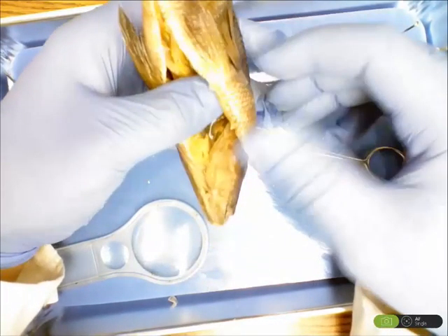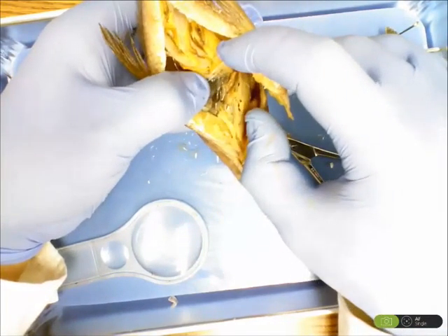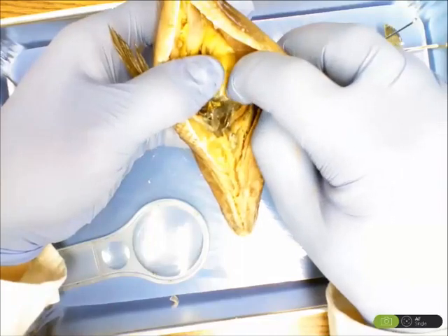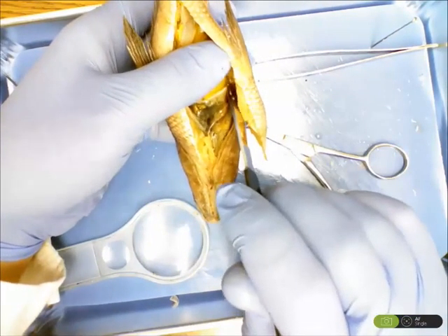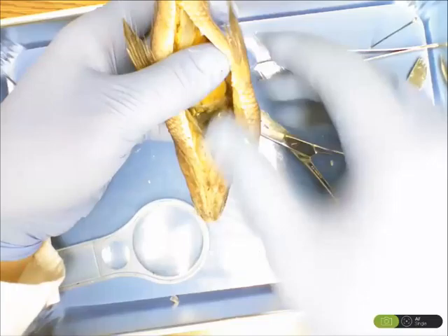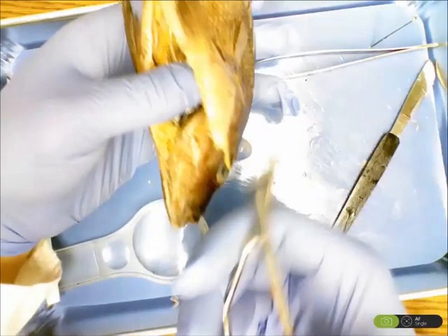Take the side that comes out easiest, like this side right here that popped out from the gill plate, from the operculum. I'm going to pry it up a little bit, and I'm going to be real careful of the organs that are in there. You'll notice that there's a thin membrane in here you need to cut away. Go ahead and cut that away, and then lift the wall right up, and then take your scissors and cut the lateral wall right away.